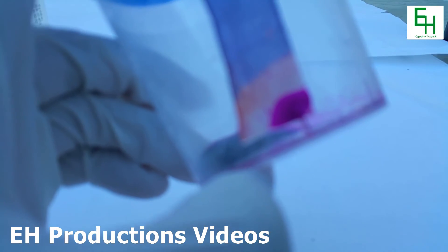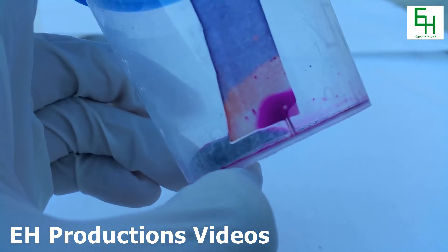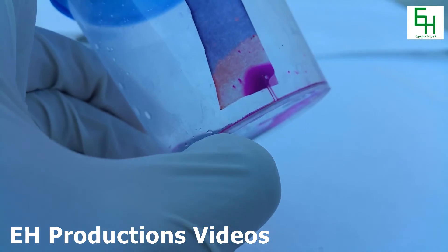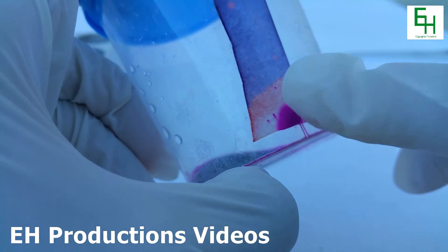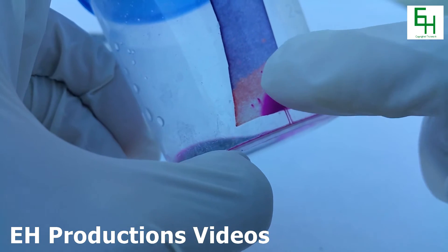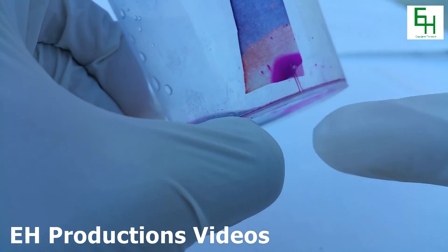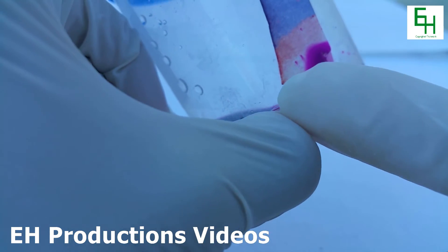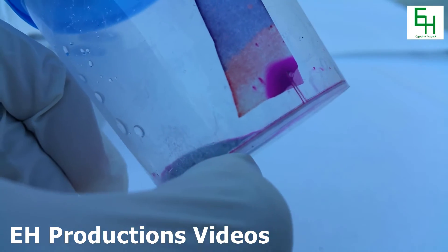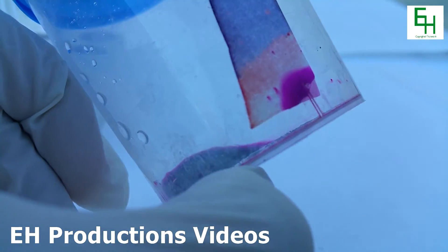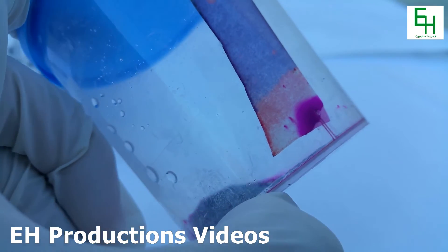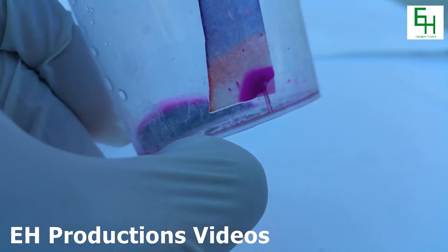You can see there's a white spot over there. Aside from the potassium permanganate stains, you can see that it's red up here and it's white down here. So the red is the red from the hydrochloric acid vapors. But down here the white, that's the chlorine that has bleached the litmus pigments. So that part is white now.